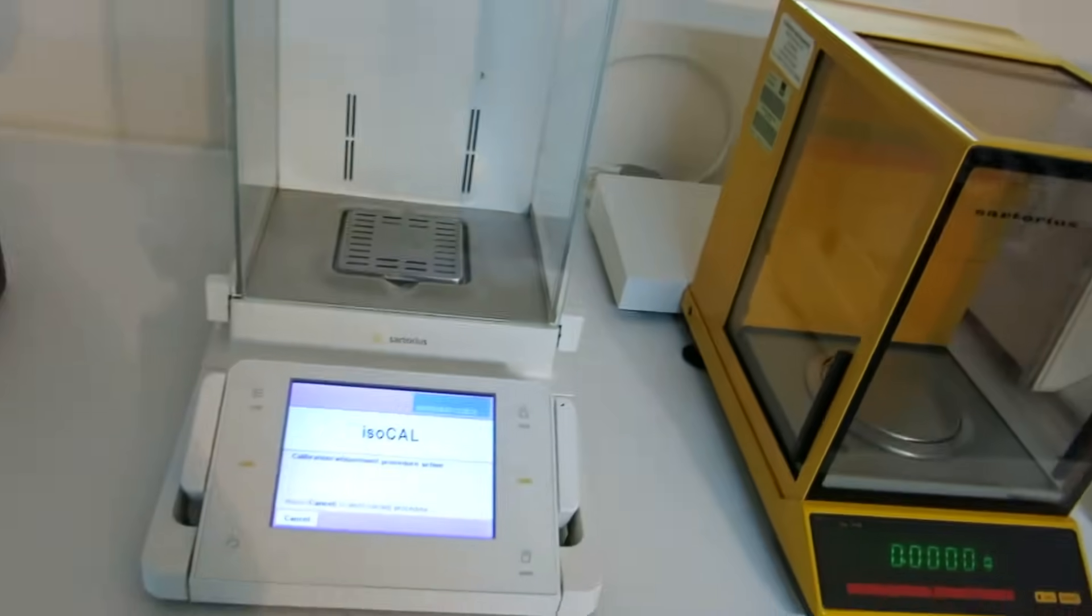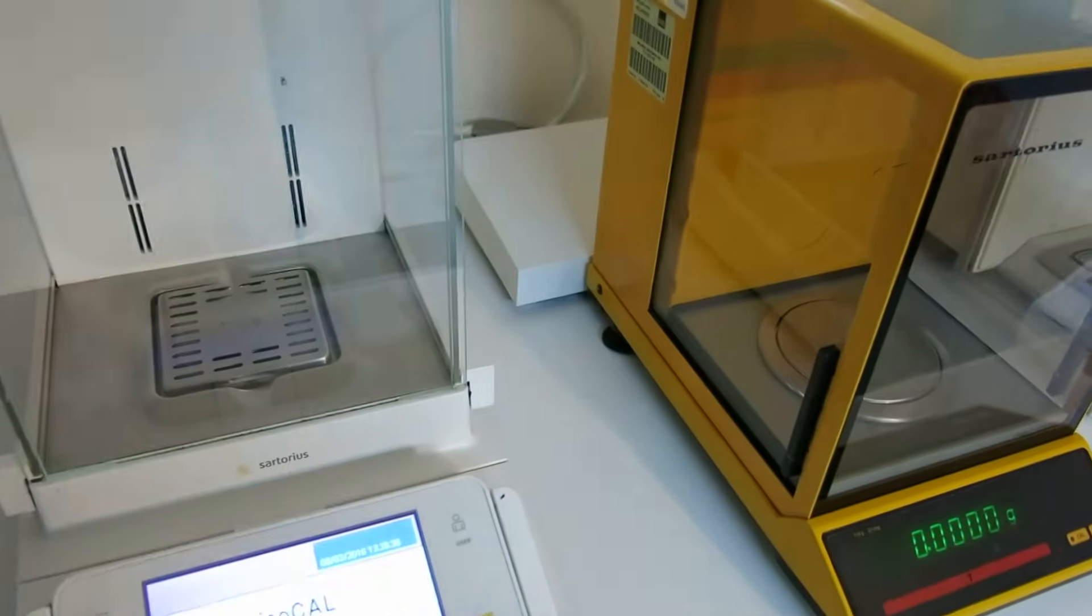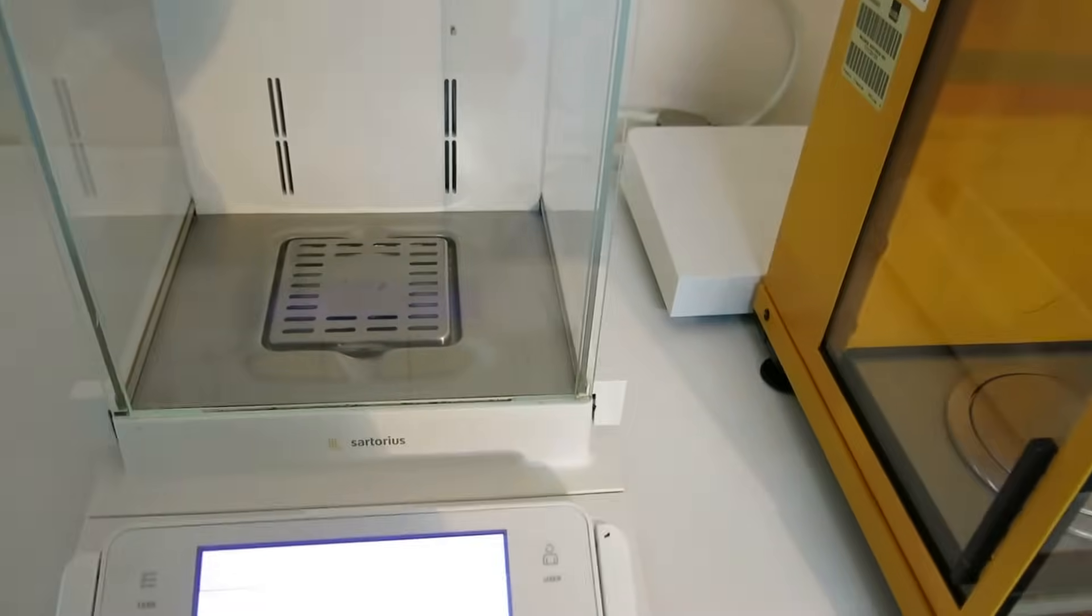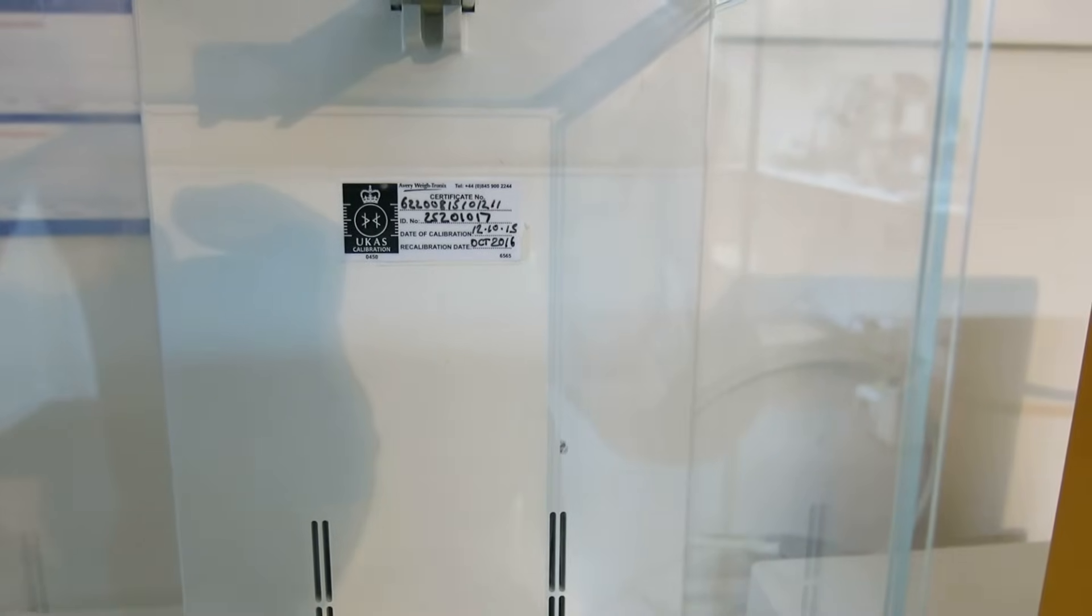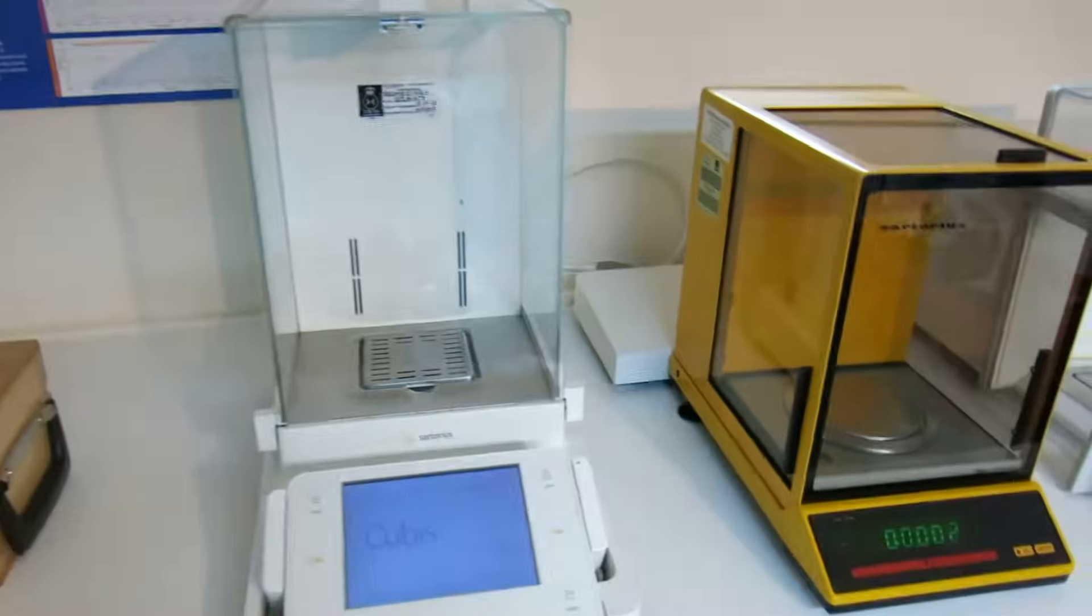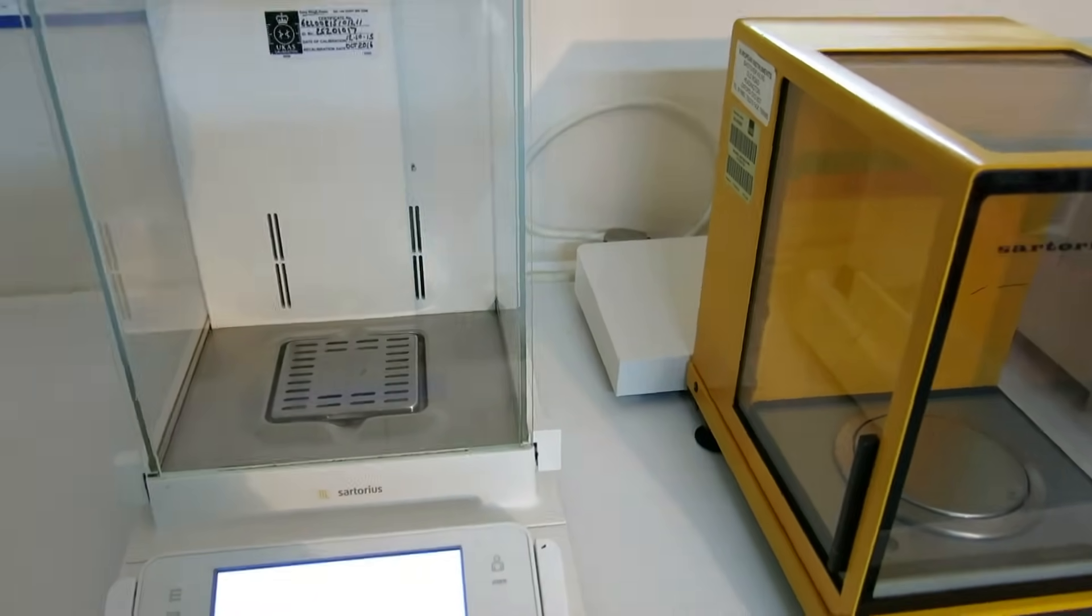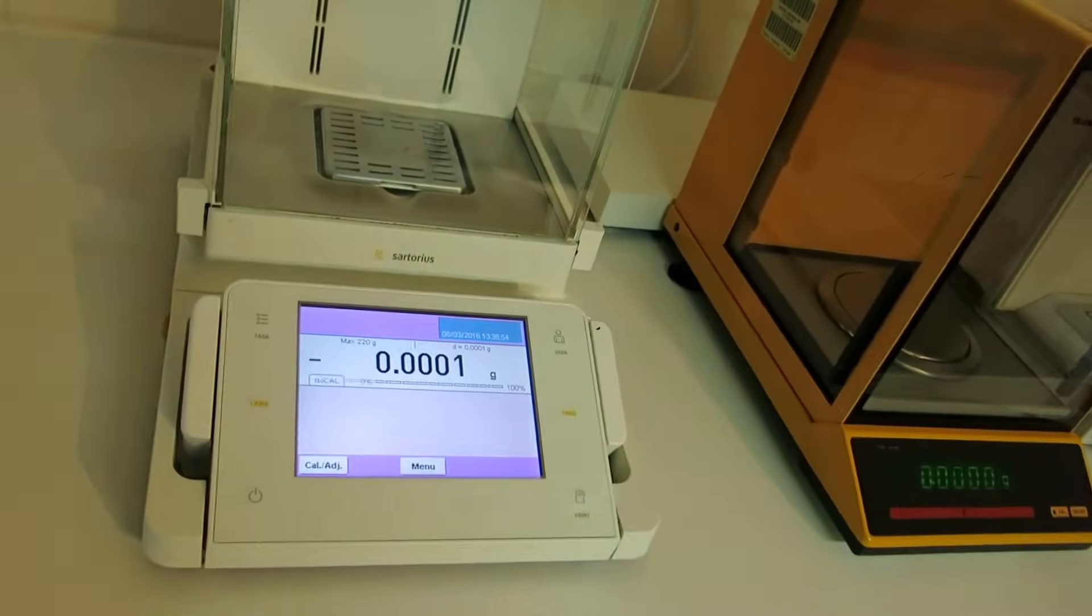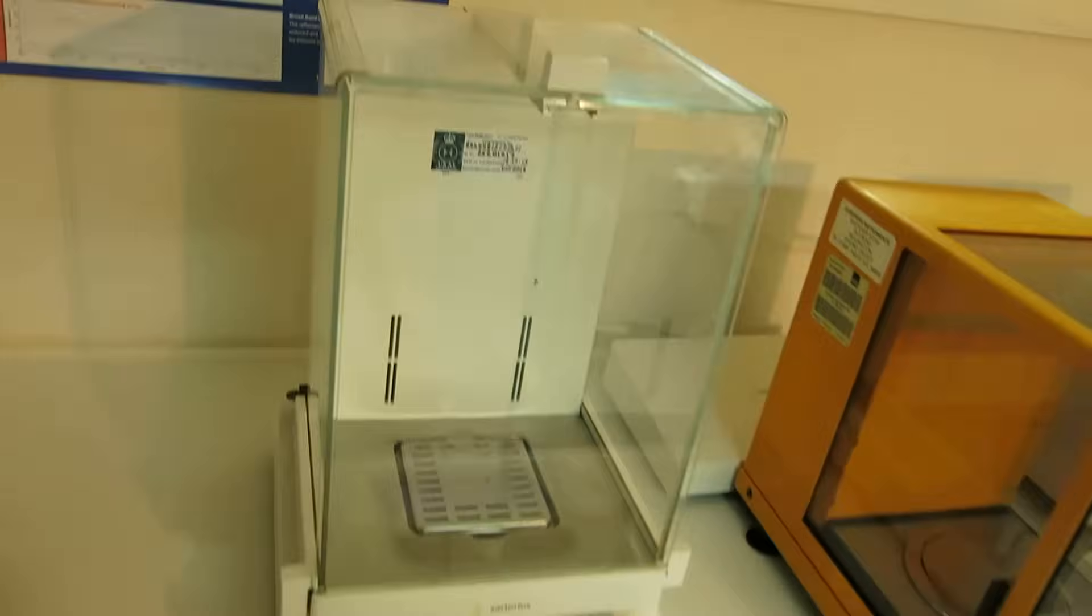Then moving on to the Sartorius 4 decimal place balance that we've got here. This is a rather nice balance. It's got a variety of different features. It's a Sartorius. It's in calibration at the moment. The calibration expires in October 2016. It's a Cubis. It weighs up to 220g. We have got photographs on the website that you can see. So we'll just put this one into mode now. Hopefully you'll be able to see it start up there. So we'll just tare it. You can see that. The condition of it is very good.